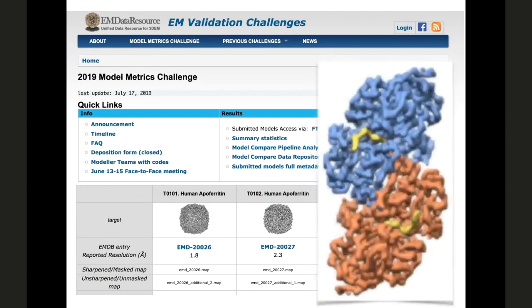So I want to focus on a particular problem. This problem deals with proteins and ligands stuck together. So you have to resolve a density, a part of which has proteins and the other part of which has ligands. So how do you deal with a problem like this? Because the biggest problem is that you really don't know what kind of interactions are there in the binding pockets of your ligands. Often the resolutions of these densities don't give you much about very specific protein-ligand interactions, but you know that these are extremely specific interactions. That's why these ligands are there. So first of all, how do you solve this sort of a problem? And then how can VMD help you solve this problem?